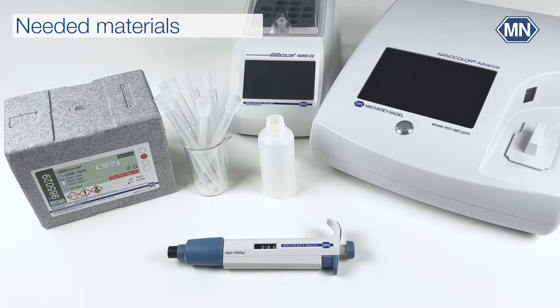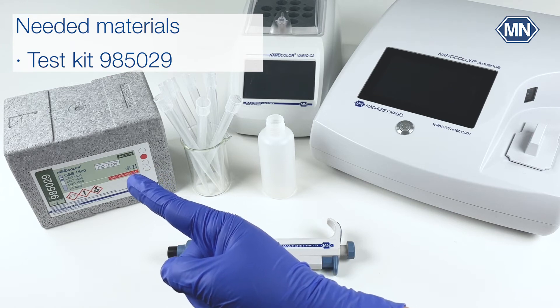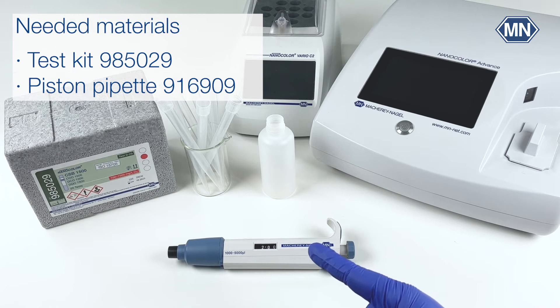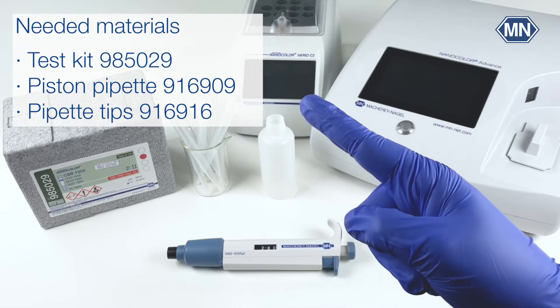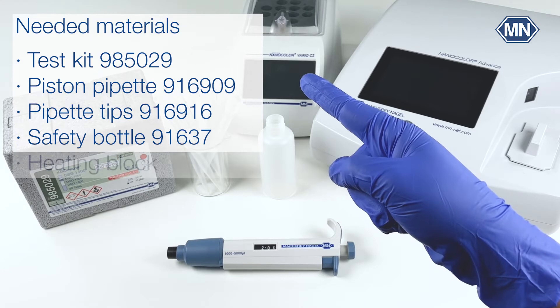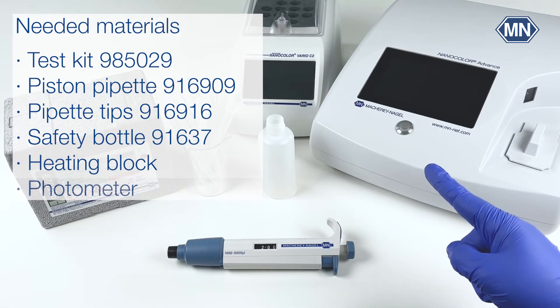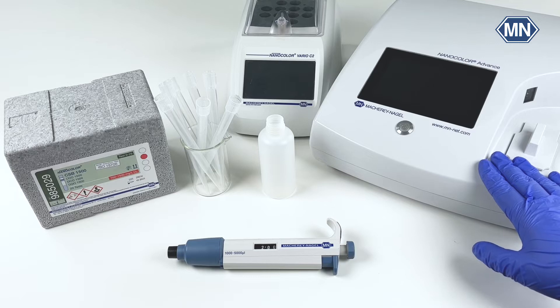To perform the Nanocolor COD 1500 test kit, you need the test kit itself, which is sufficient for 20 determinations, a 2 milliliter piston pipette, suitable pipette tips, a safety bottle for shaking the tubes, a Macherey-Nagel heating block, and a photometer. In our case, our spectrophotometer Nanocolor Advance, which is perfectly suited for mobile and laboratory water analysis.